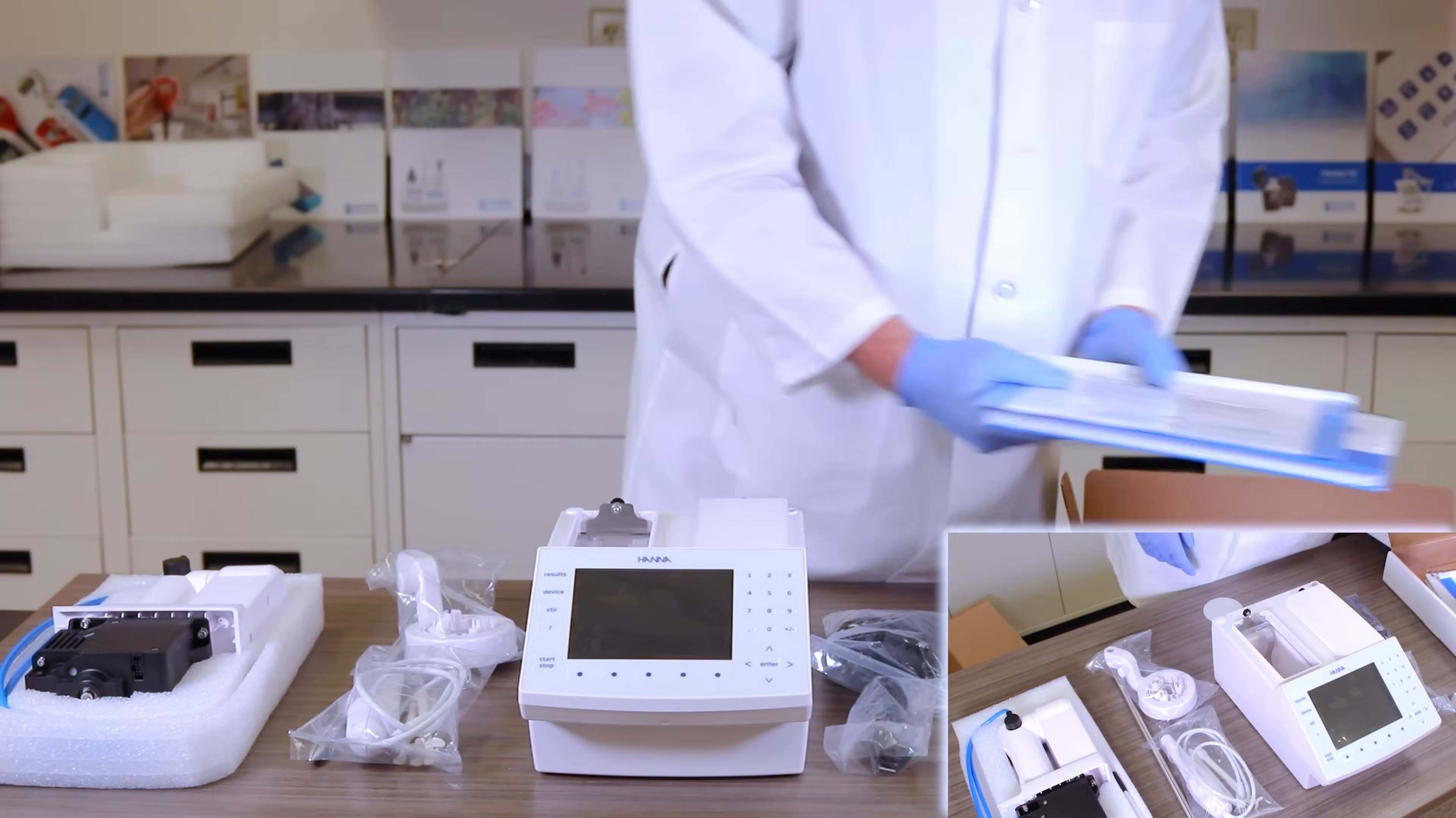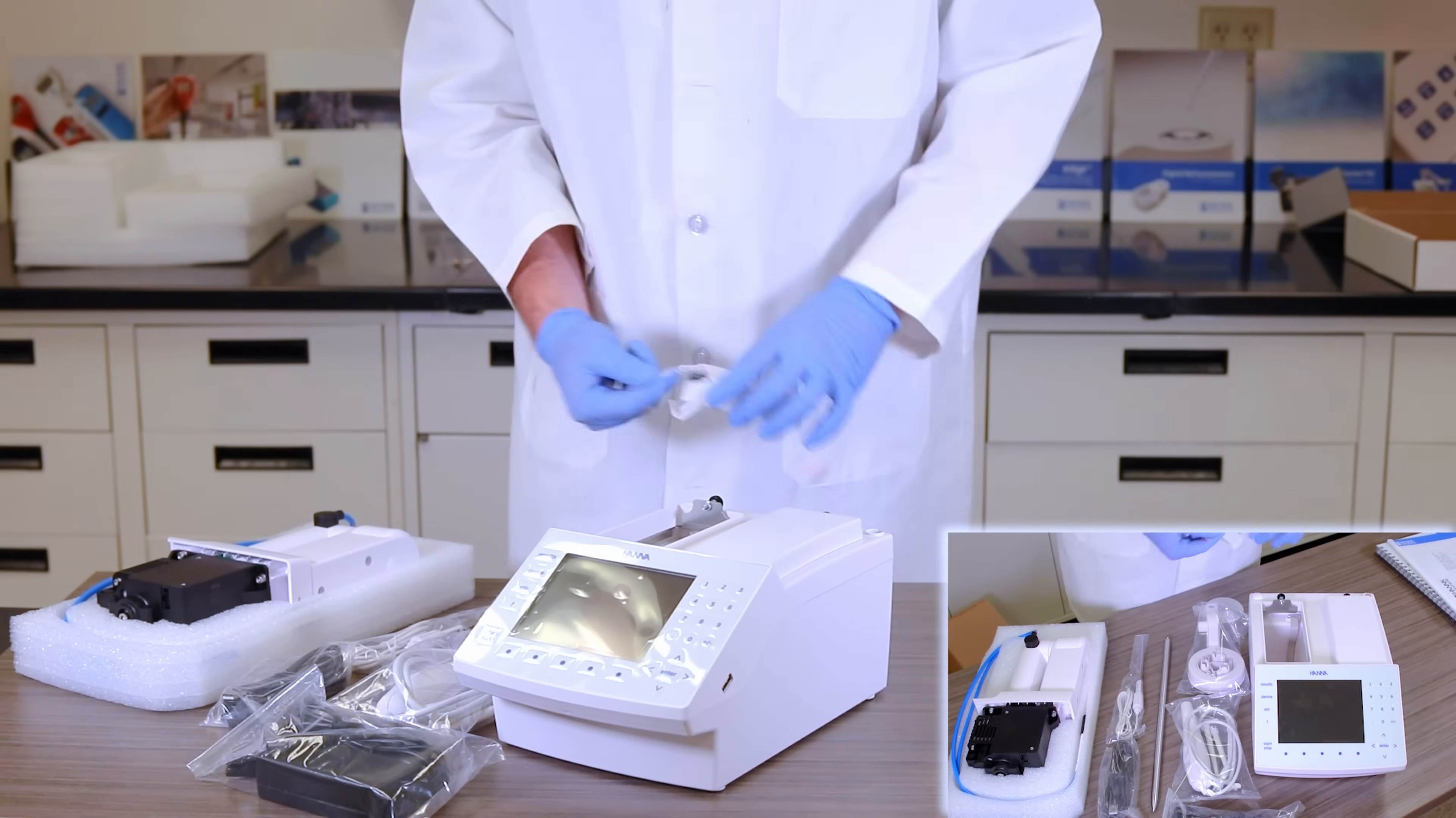First, find your titrator base. Place the base where you would like your titrator to be for operation.